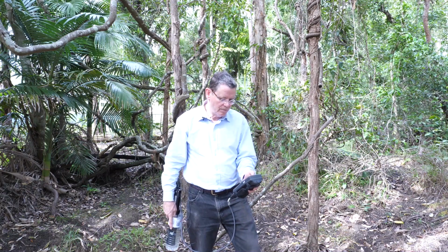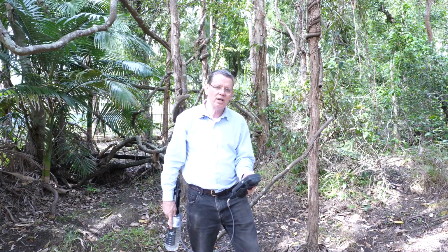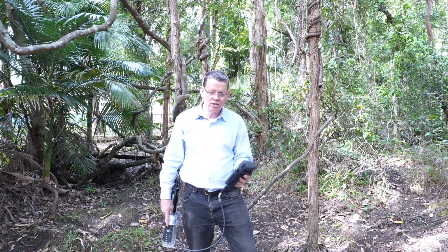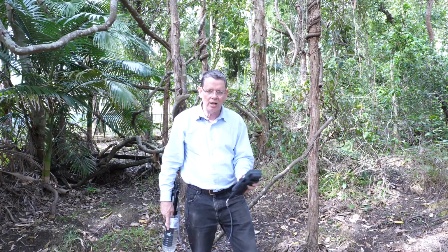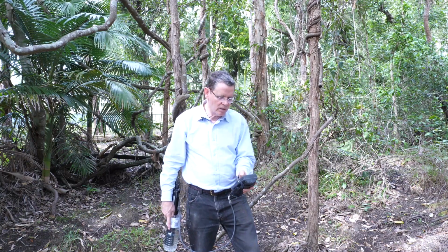NTU, so nephelometric turbidity units, is 6.1. So once again, just a little bit more sediment than we've seen in earlier sites. And just so you know, I was in a very shallow pool to collect the water, so I probably stirred up a bit of mud in doing that.